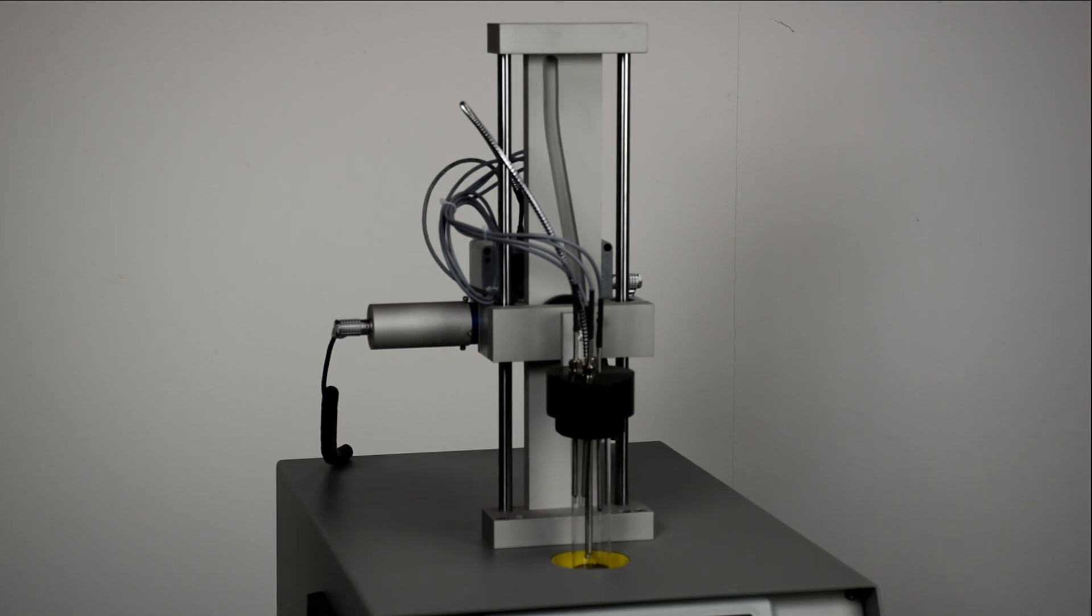Cloud point is determined by measuring the percentage of reflection of an infrared beam projected towards the reflecting jar bottom. Pour point is determined by extracting and tilting the jar while two probes detect the sample movement.